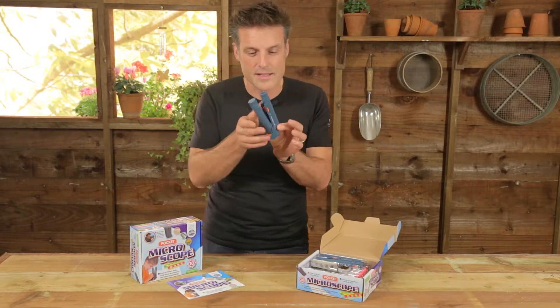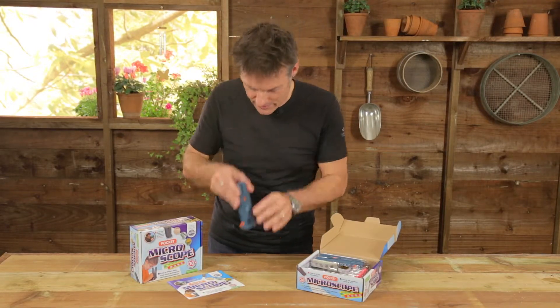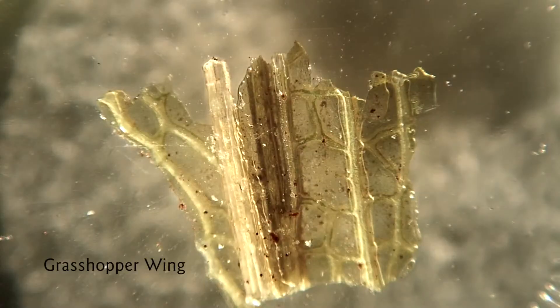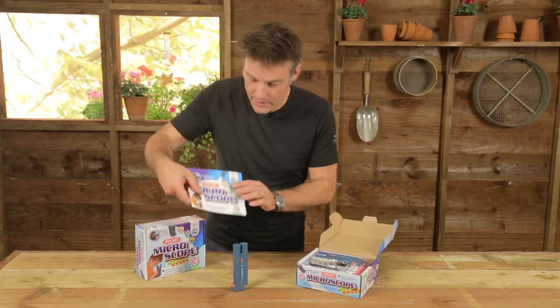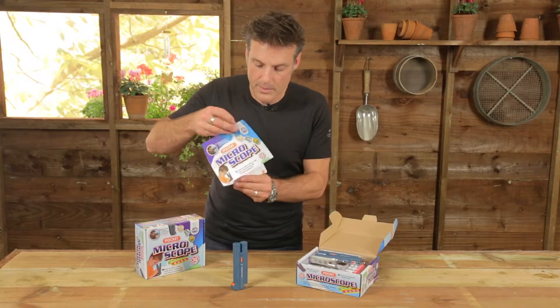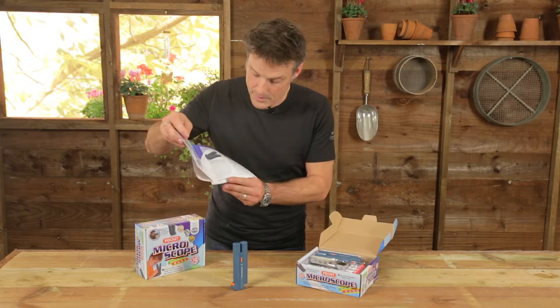It's as simple as that — it's really a looking device. The magic again is in the subject that you choose to put under it. And to help you in your quest we've got a booklet; like all my kits it comes with a booklet to show you how to get the most out of your microscope, how to use it effectively.